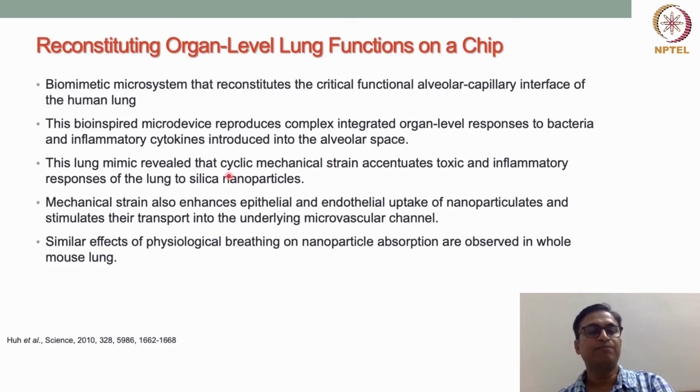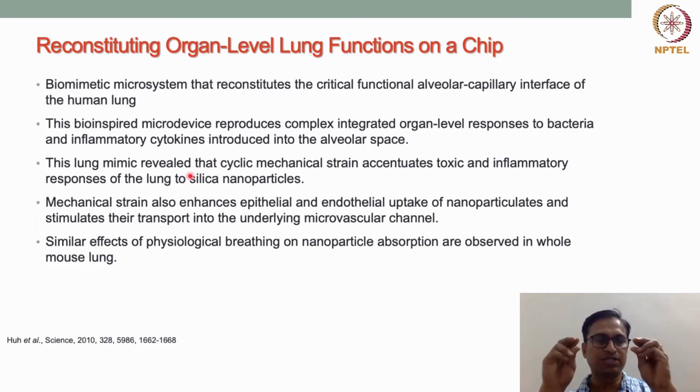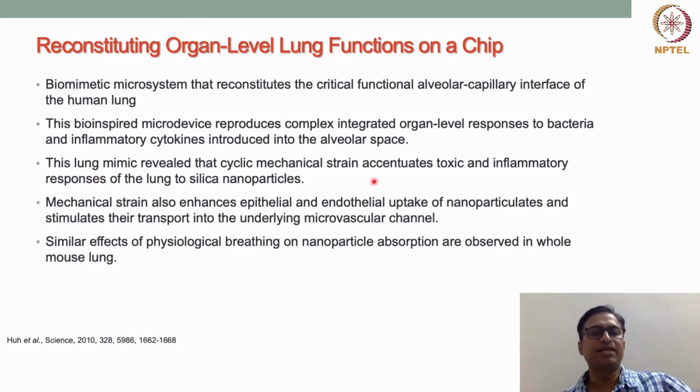As I mentioned, because through the side channels they applied vacuum so that the membrane can be strained, this lung can mimic the cyclic mechanical strain. This can accentuate the toxic and inflammatory response of the lung to silica nanoparticles. When they introduced silica nanoparticles within the alveolar space, they found that a toxic response is generated.